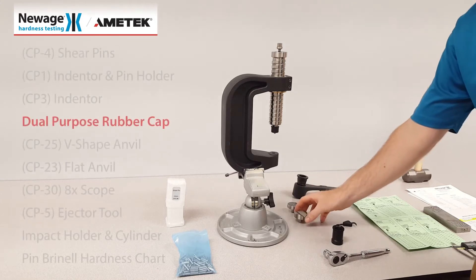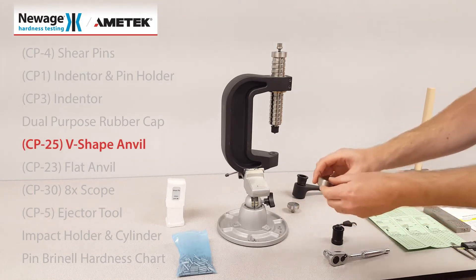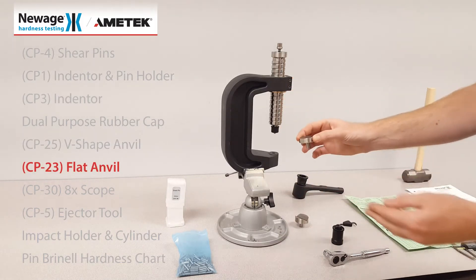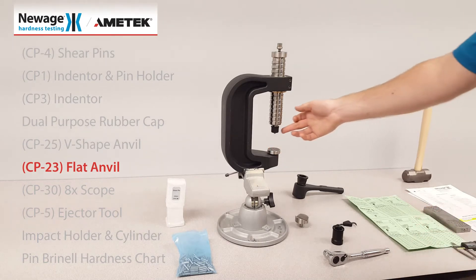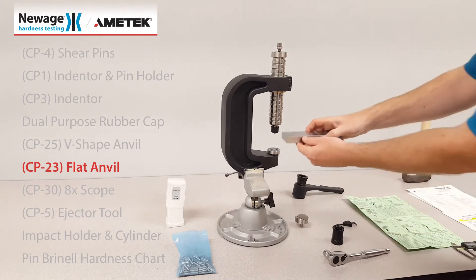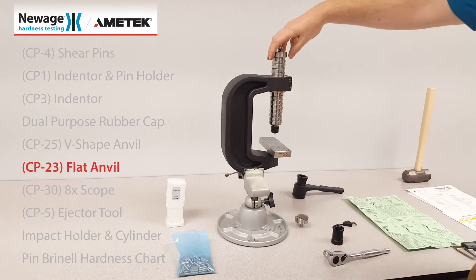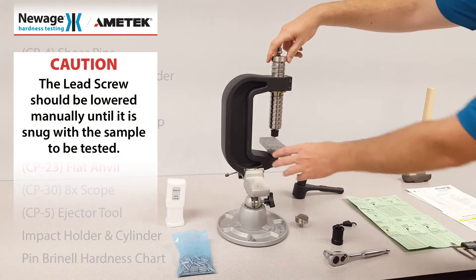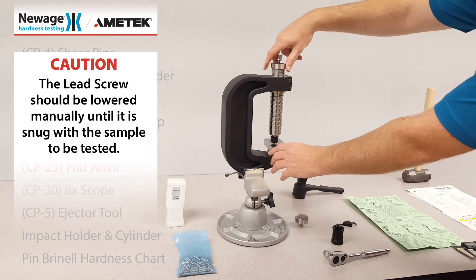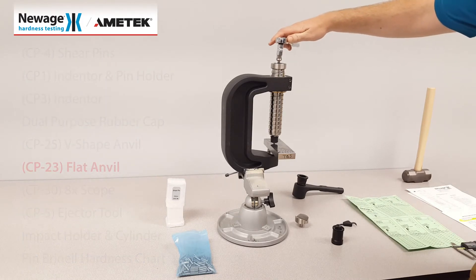Provided in the kit is a V-shaped anvil and a flat anvil. Your indenter should be perpendicular to your test sample. Screw down the large screw to your sample and ratchet down the drive screw until the pin breaks.